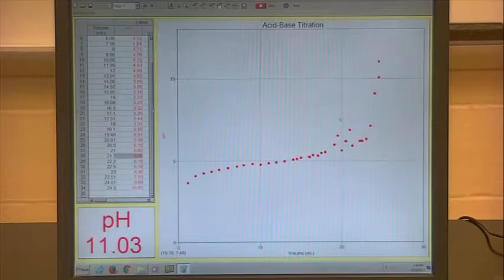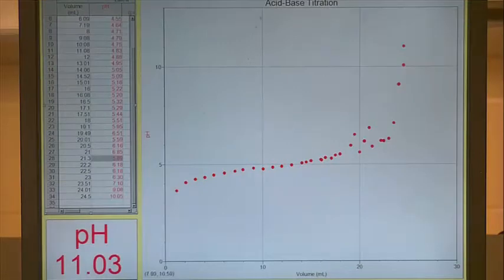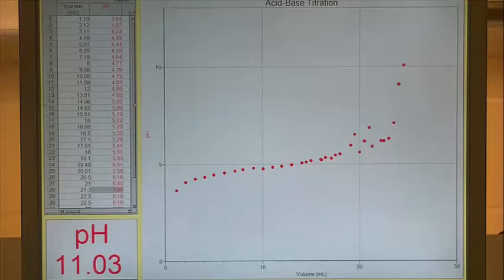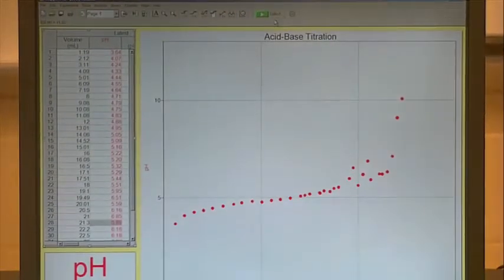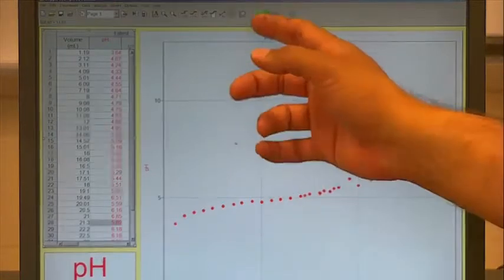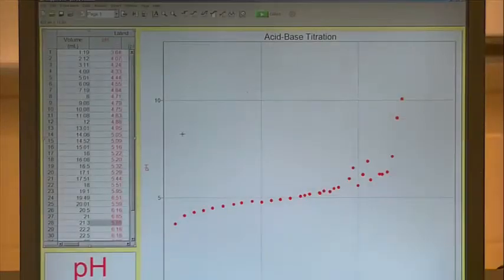So the first derivative, in order to get that, we will click on our pH axis label. Before we do anything else, I just want to mention, when you're done collecting your data, hit stop. You never want to hit stop in the middle of collecting data. If you do, by accident, hit stop, just click append to data. So it's not the end of the world if you hit stop, but just make sure that you click collect again and you append to your pre-existing data set.